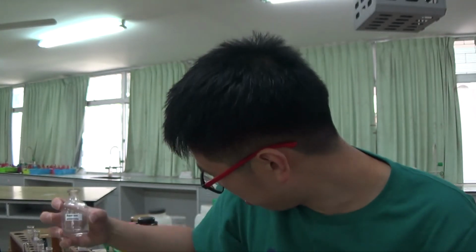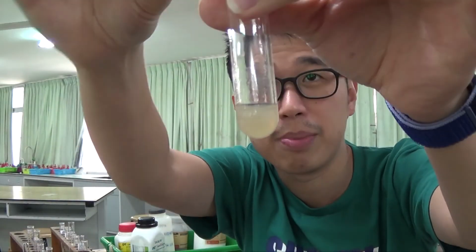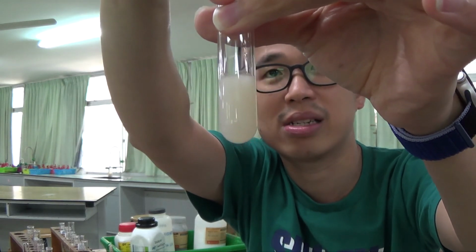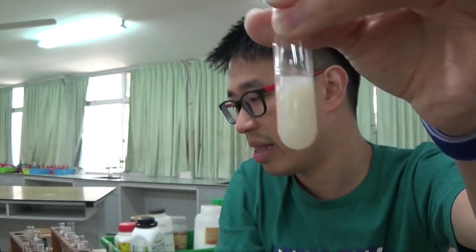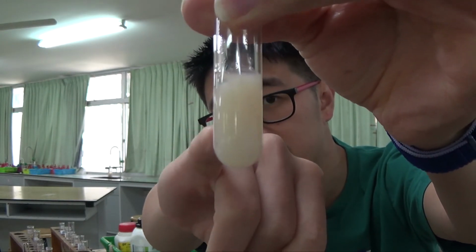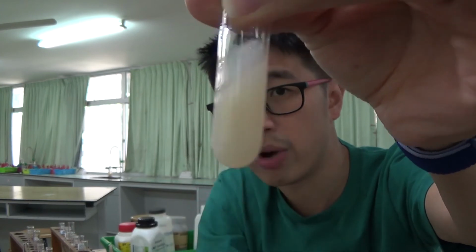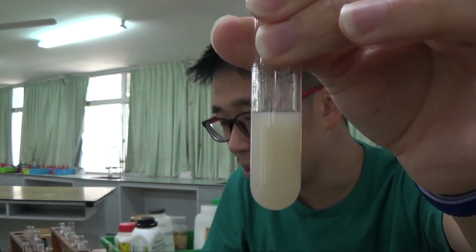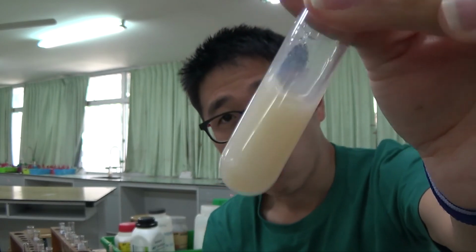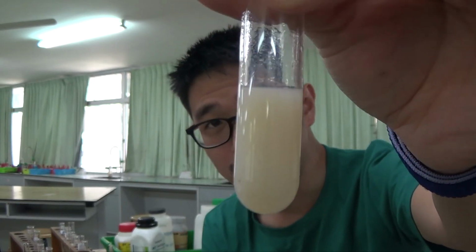I should have written it down first, but anyway, I don't want my ammonia to escape as a gas anymore, so I'll just add the ammonia in excess. That was actually excess ammonia already, because I started with this much, I added this much, and then I added even more ammonia. When I added even more, this precipitate does not dissolve anymore.